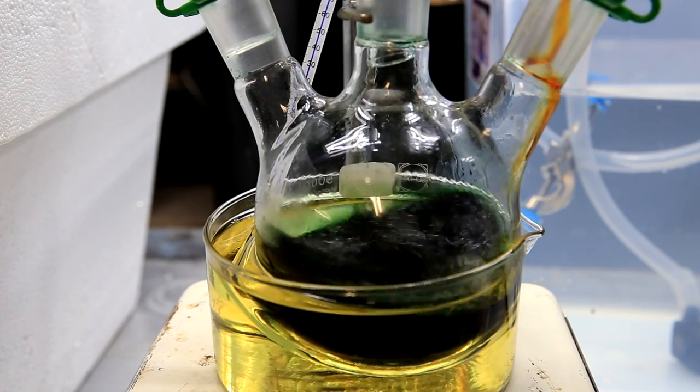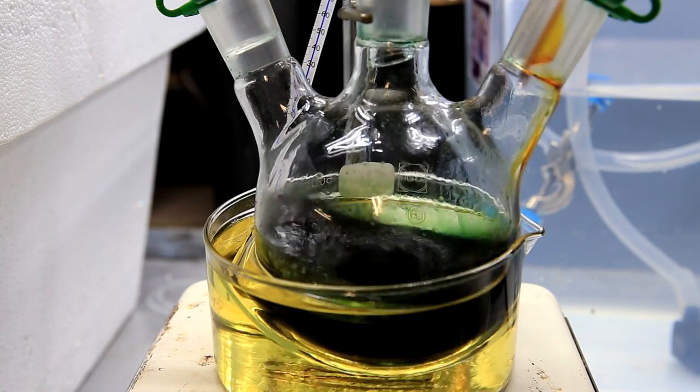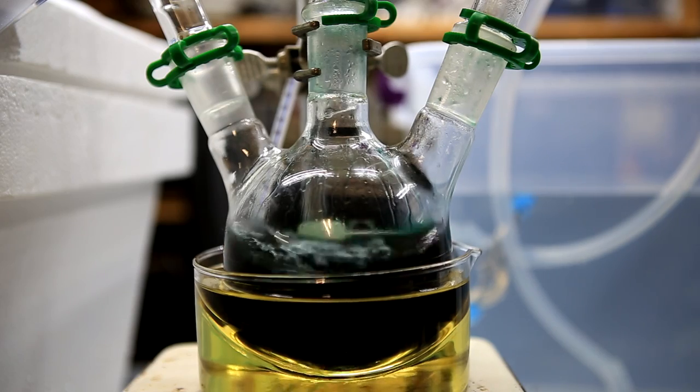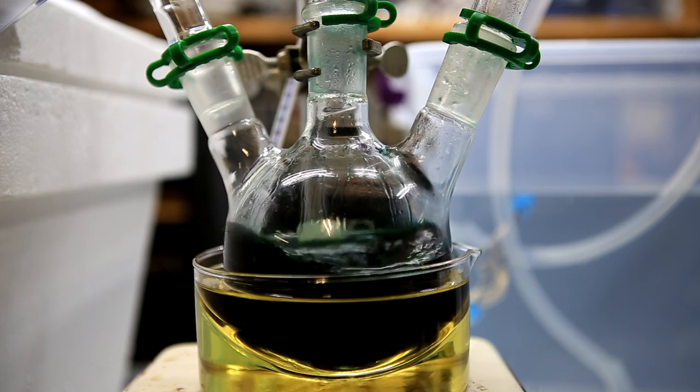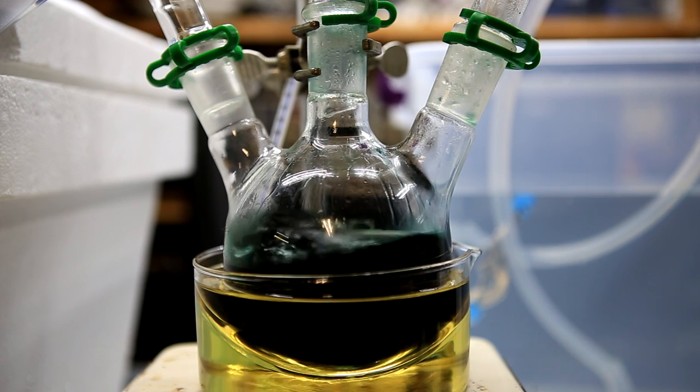As more and more chromic acid is added, it'll get darker and darker green until it nearly becomes black. Once all of the chromic acid solution has been added, keep boiling it until no more distillate comes over. I boiled it for about 15 minutes after everything had been added.